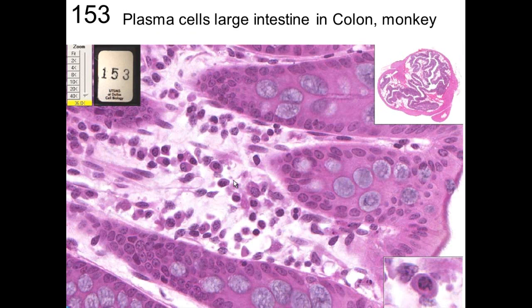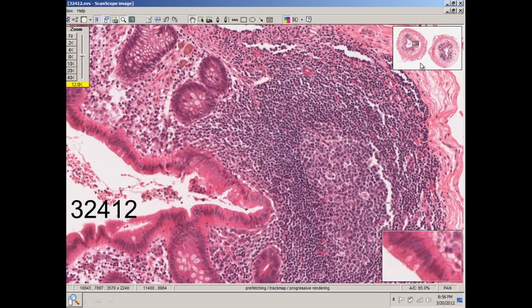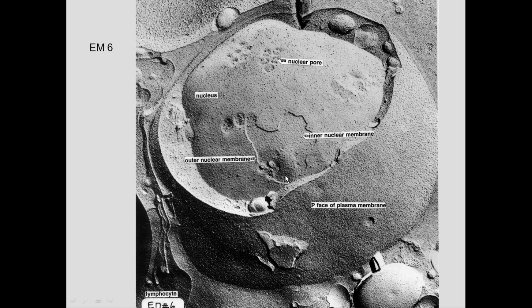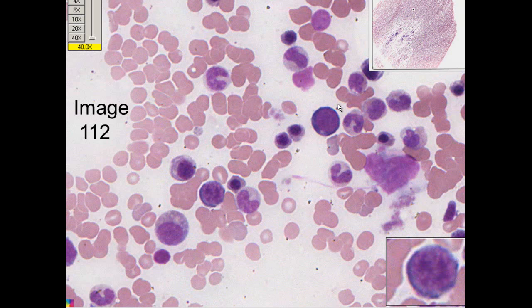In the colon there are many plasma cells visible. In the appendix there is another lymphatic nodule with a germinal center and many cells ready to respond to anything they are exposed to. The main players are lymphocytes: T lymphocytes make killer cells or memory cells, and B lymphocytes make plasma cells that produce antibodies. These are derived from the bone marrow, where we can see early red blood cells such as pronormoblasts and band cells in neutrophil production.